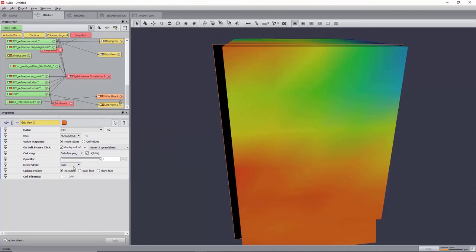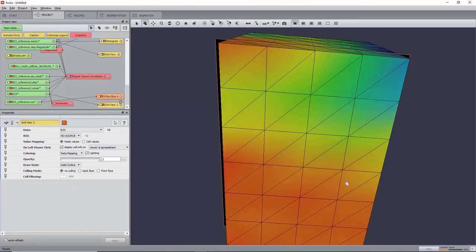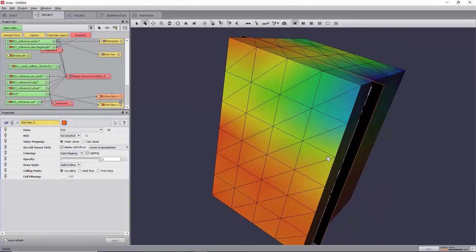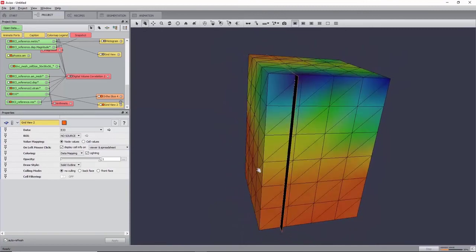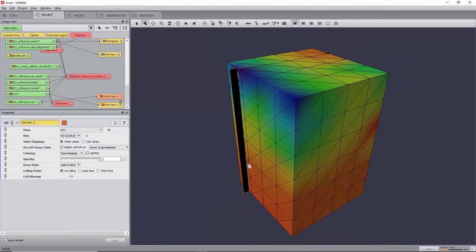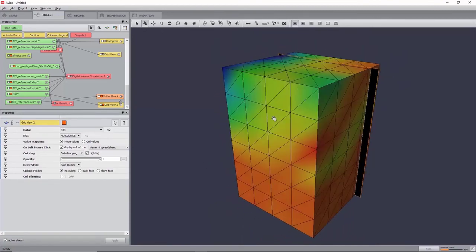Now, set the draw style to Solid Outline. For more visualization options, please refer to the Digital Volume Correlation Analysis tutorial in the Aviso User Guide.